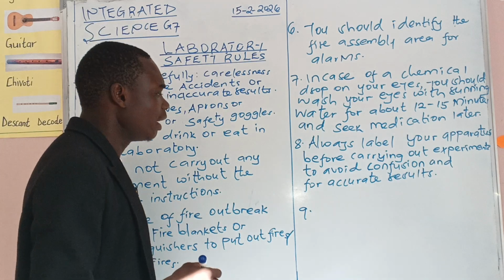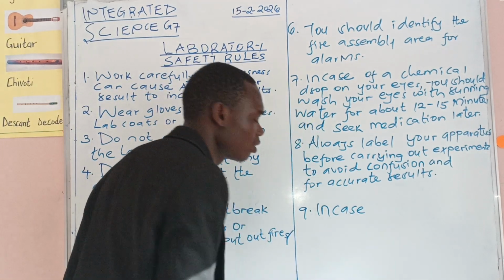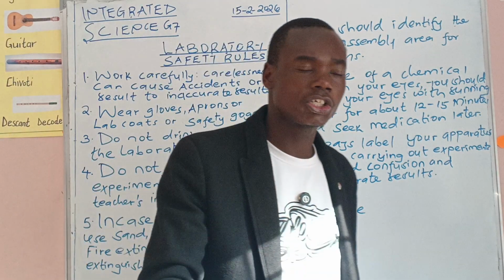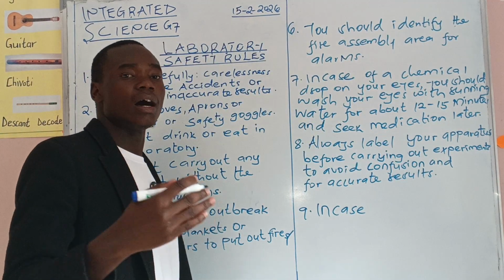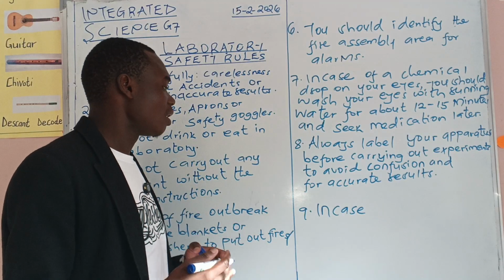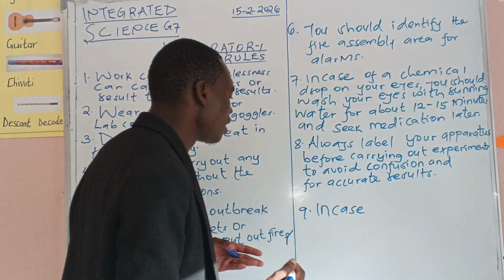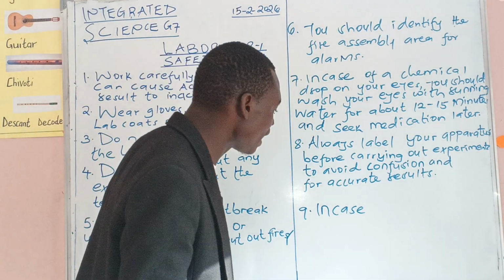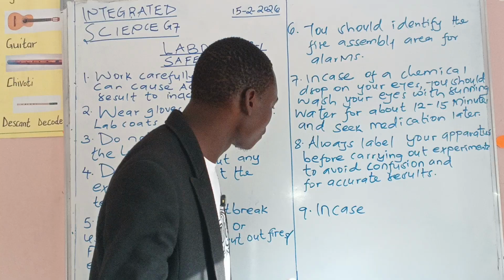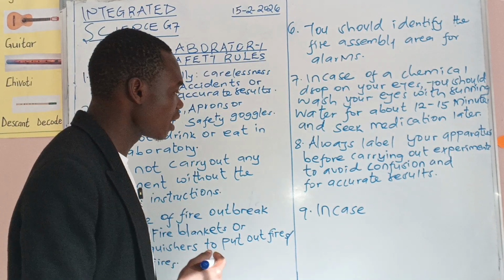Now, how about when you get an electrical shock, or maybe there is electricity within the laboratory and a shock has happened to a learner or a person carrying out an experiment within the laboratory? What are you supposed to do?